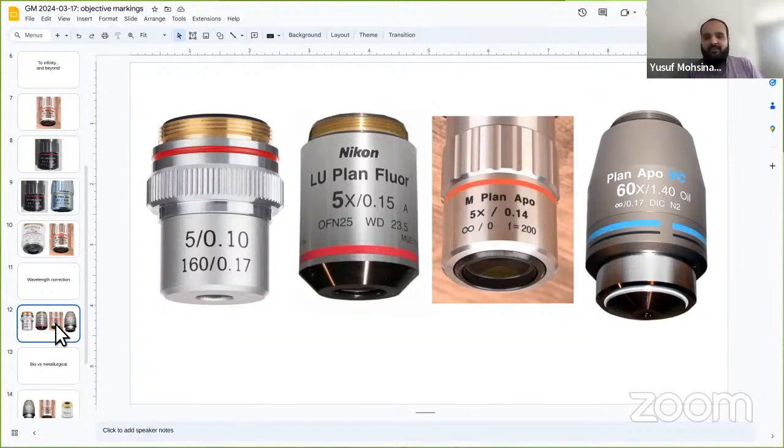And you mentioned 3 or 4 wavelengths. Are there specific wavelengths they concentrate on, or does it just depend on whichever the manufacturer thinks matter? I believe, and it's been a while since I've reviewed this, what I vaguely recall is there are a few wavelengths that are common. So I think there's 550 nanometer light, like you can get a certain green filter for example. And I think they've made sure that at 550, it's really well corrected. And then if you go slightly outside of that, it might be a little less well corrected.